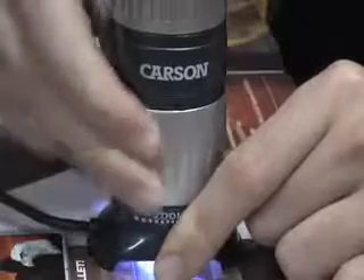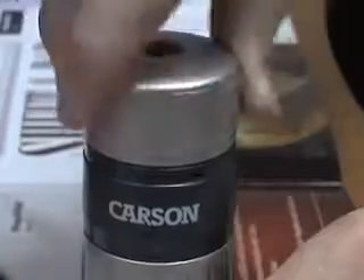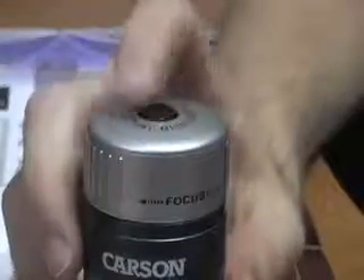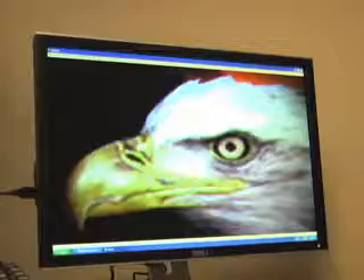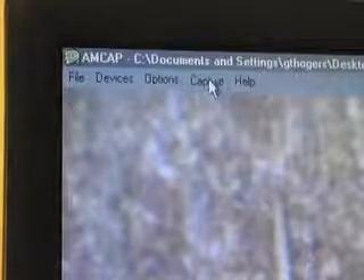To zoom between 26 and 130 times magnification, twist this ring left or right. To focus, turn this ring left to right until you get a clear image. To capture pictures, click the top shutter button and the image will pop up in the new screen. Capturing video is just a click away.